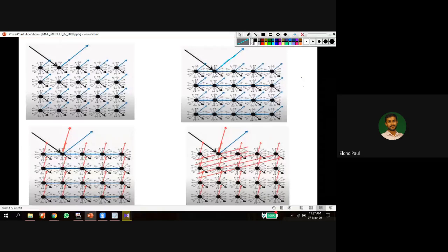But the scientist Bragg interpreted it in another way. Instead of diffracting from a particle, this X-ray is diffracted with respect to this plane. Here we can see horizontal planes, and the incident beam is diffracted in a particular direction. If you take this angle theta, the angle between the incident beam and this plane is equal to theta. This will also be equal to theta.